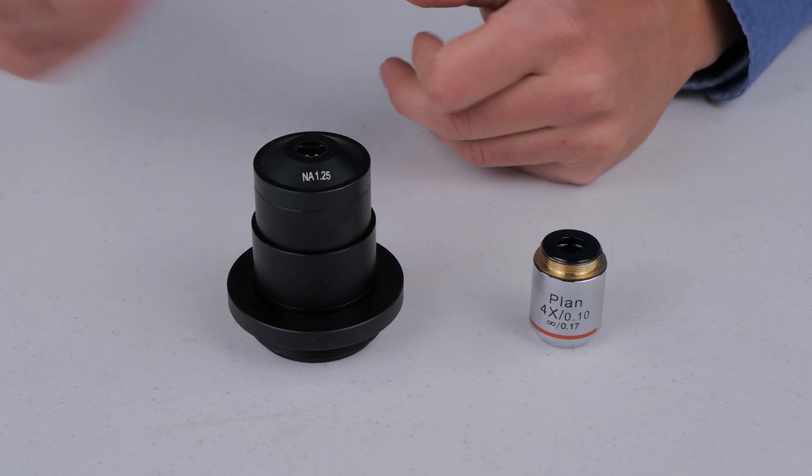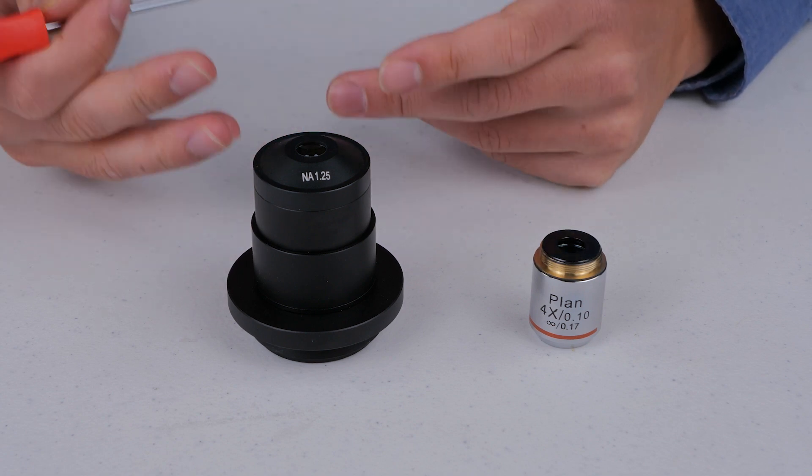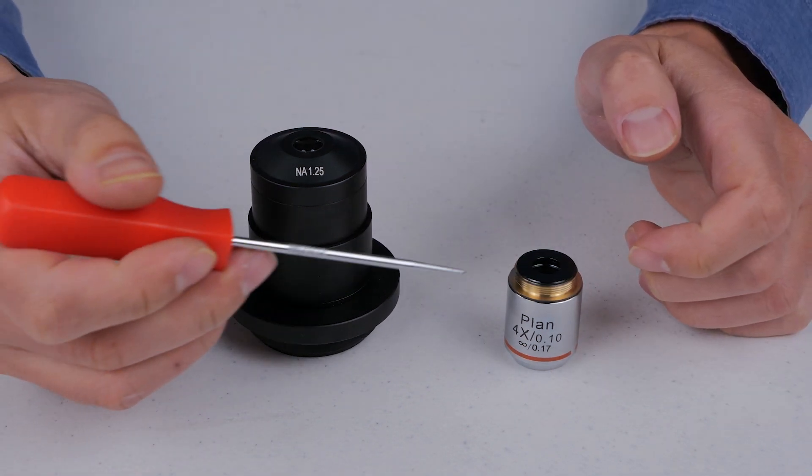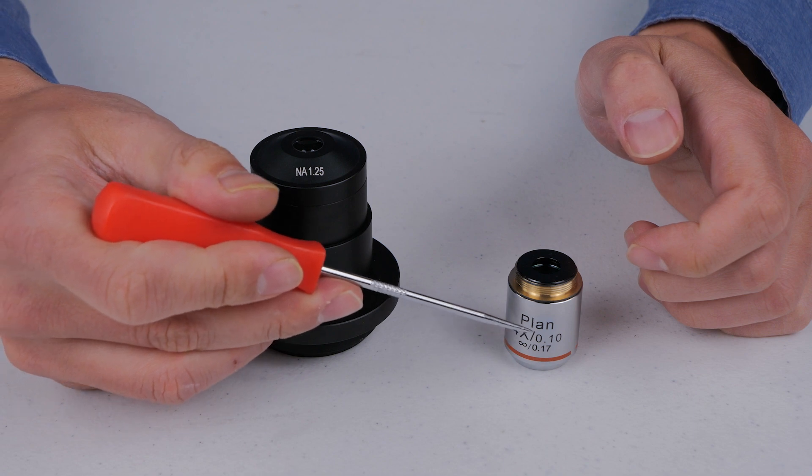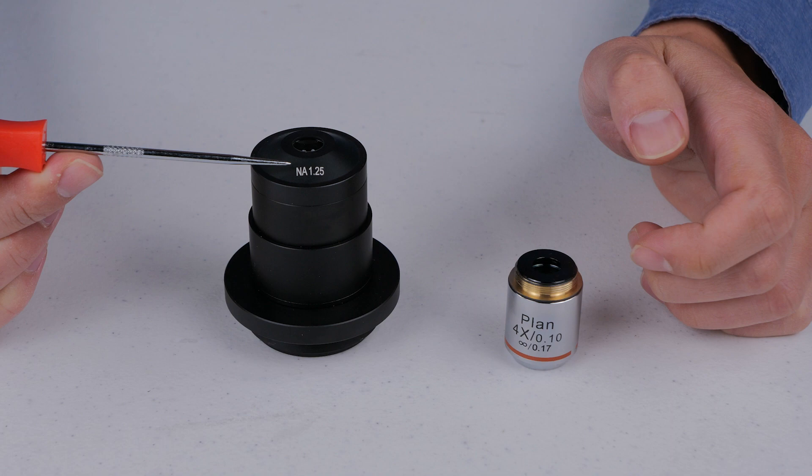What is numerical aperture in microscopy? The simplest way to understand it is it's just the angle of light that is coming into or going out of something. The most common place you'll see a numerical aperture number is on a microscope objective, so that would be this 0.1 number right there, or on a microscope condenser which is 1.25 on this one.